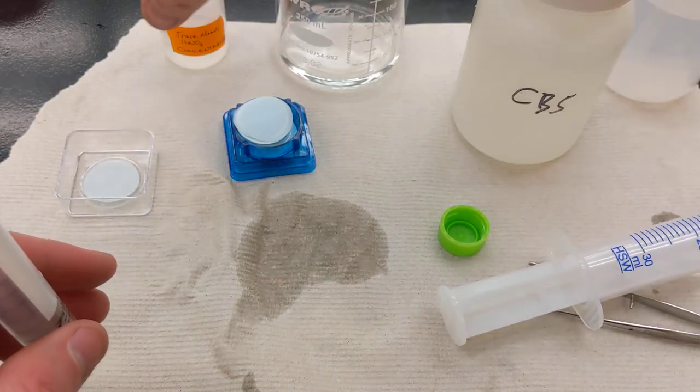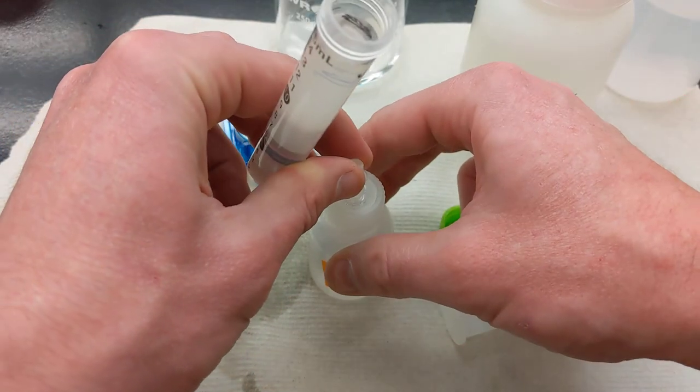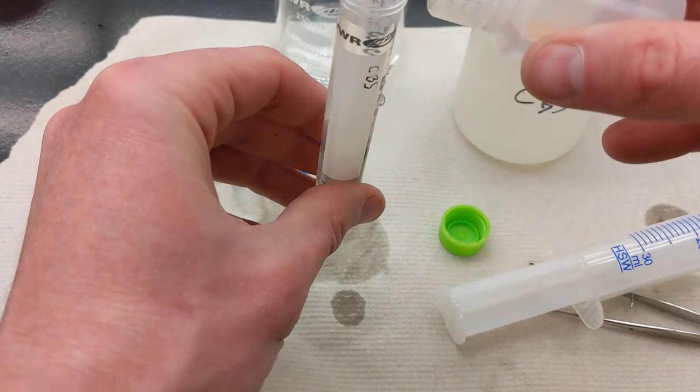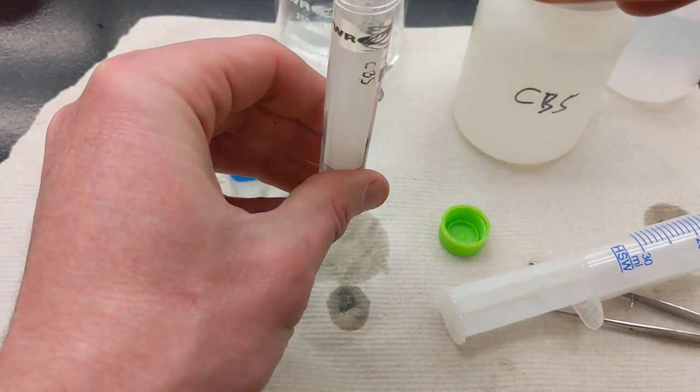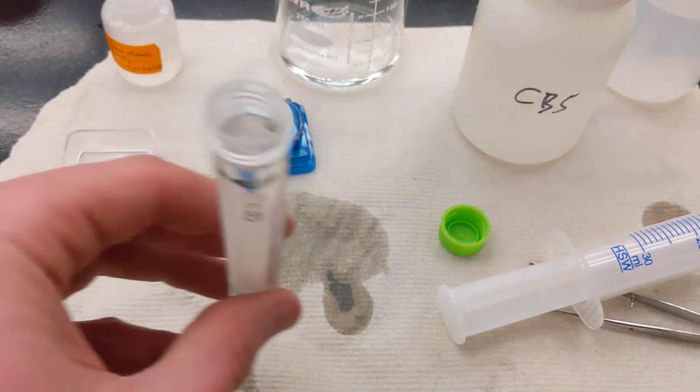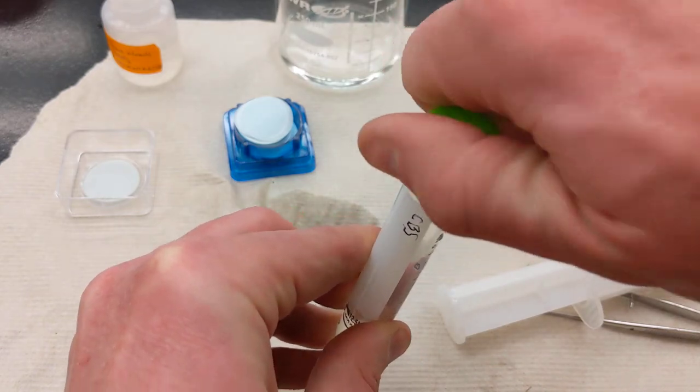And then I will take my concentrated trace metals nitric acid. Be careful here if you're not using gloves for this step. And then you'll want to add a few drops until you have reached less than pH 2.